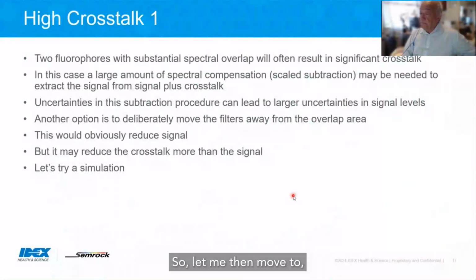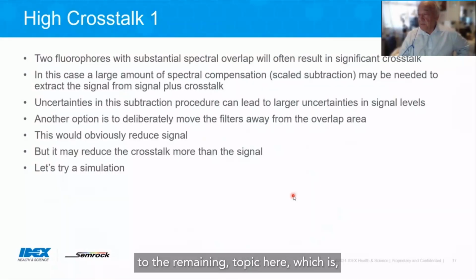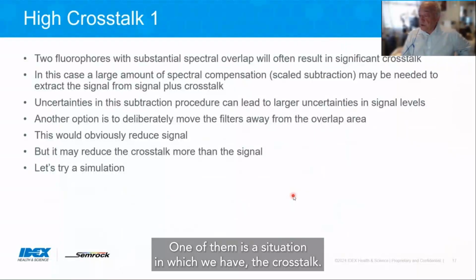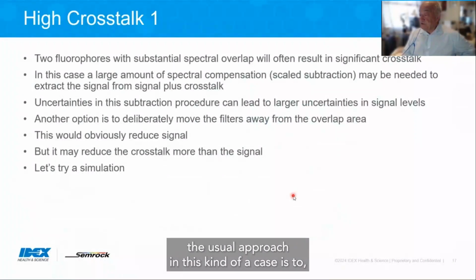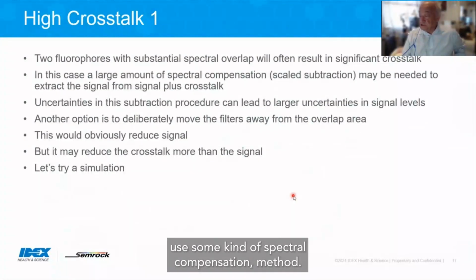So let me then move to the remaining topic here, which is the two aspects of interest for this particular talk that I thought might be interesting. One of them is a situation in which we have crosstalk present, and let's suppose a significant amount.